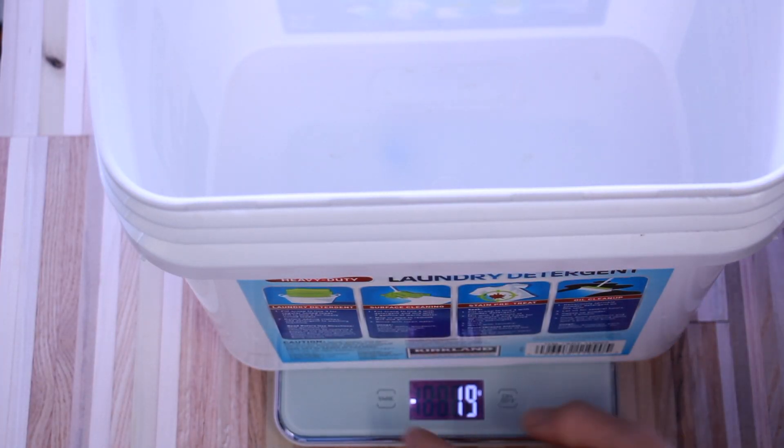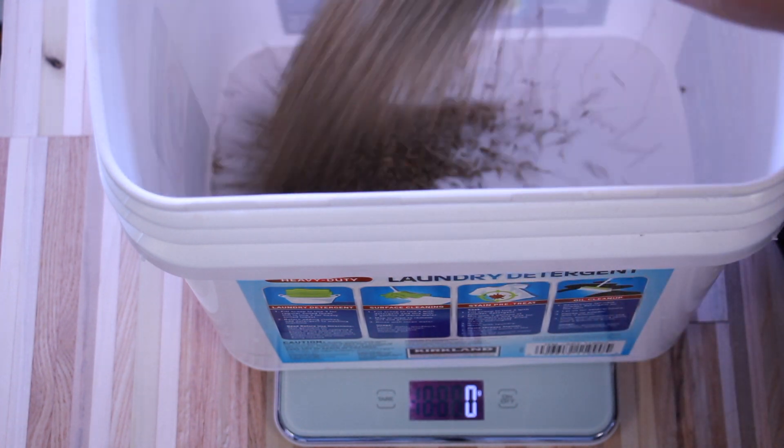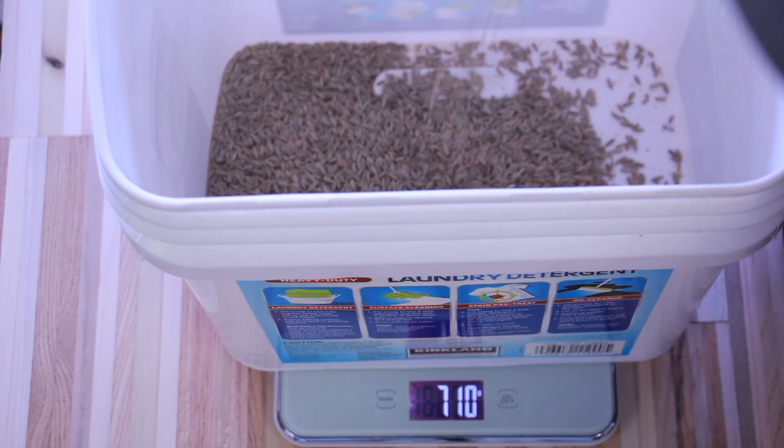Weigh out the desired amount of grain that you want. You'll want to use about 90 grams of dry rye grain per one pint jar that you plan on building. So if you're doing half pint jars, that would be 45 grams of dry rye grain.